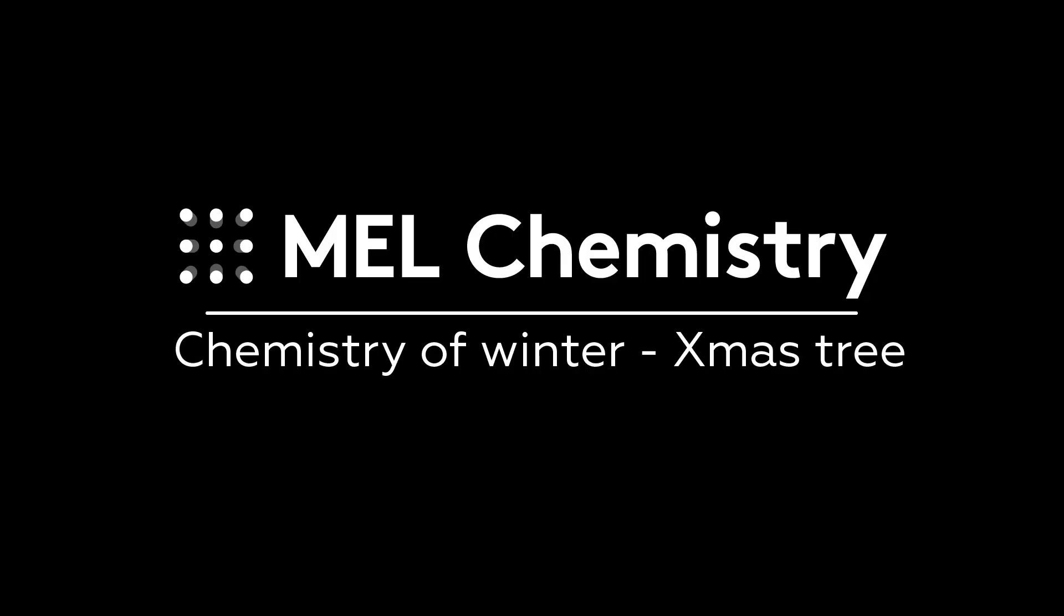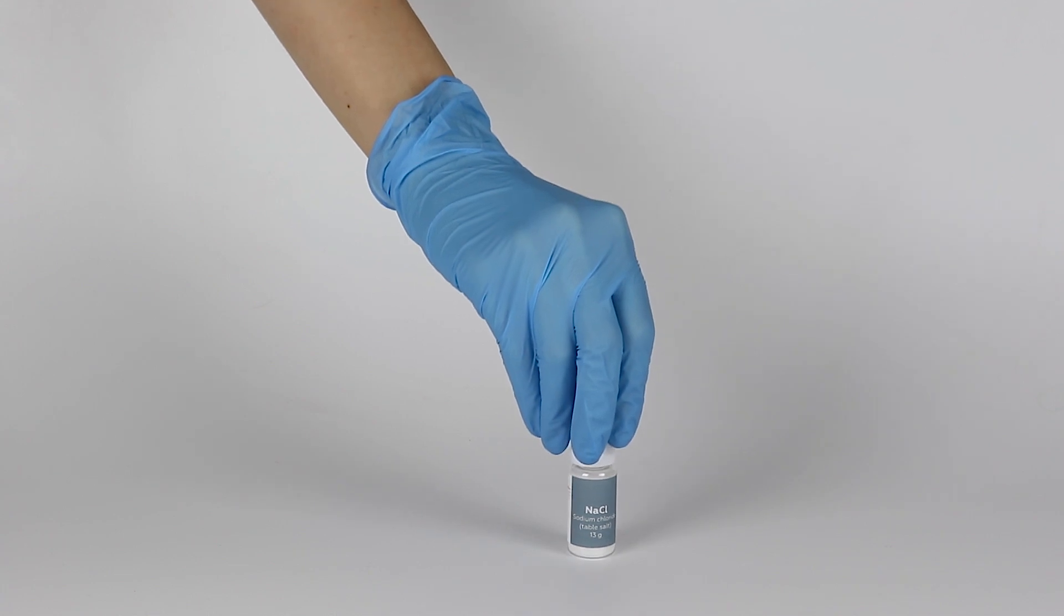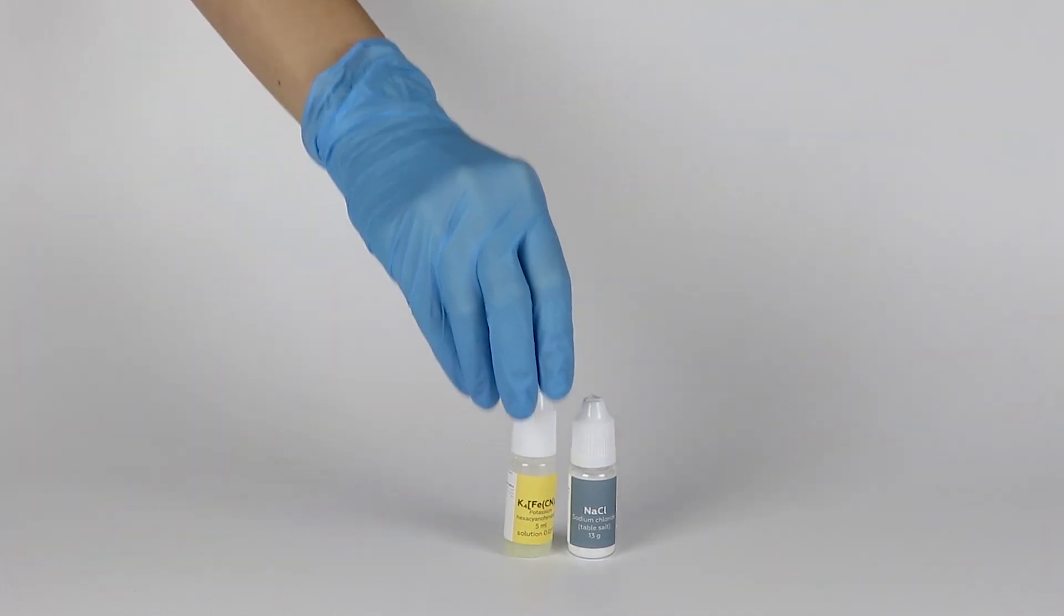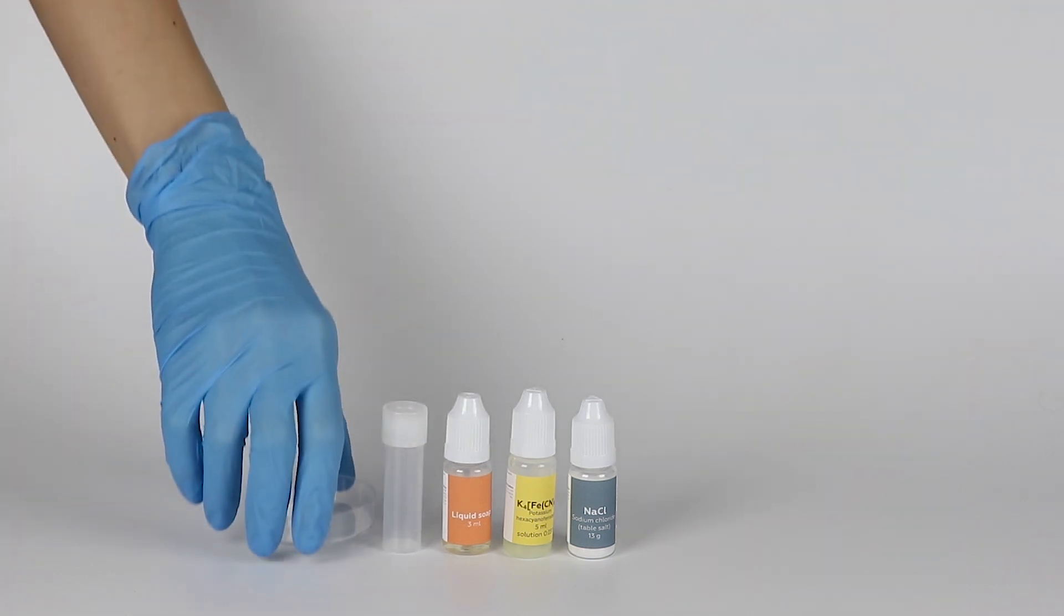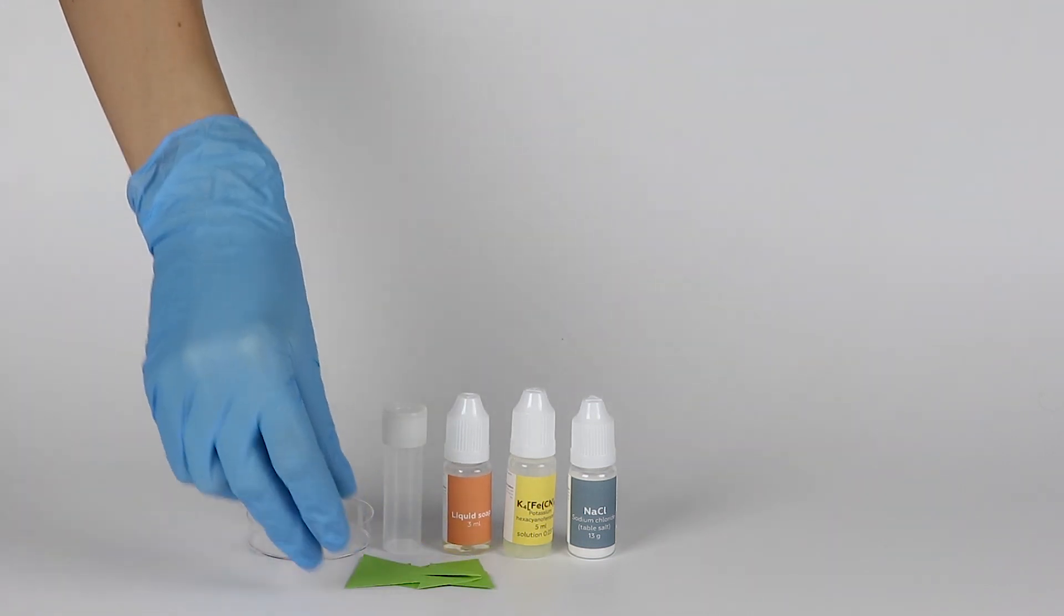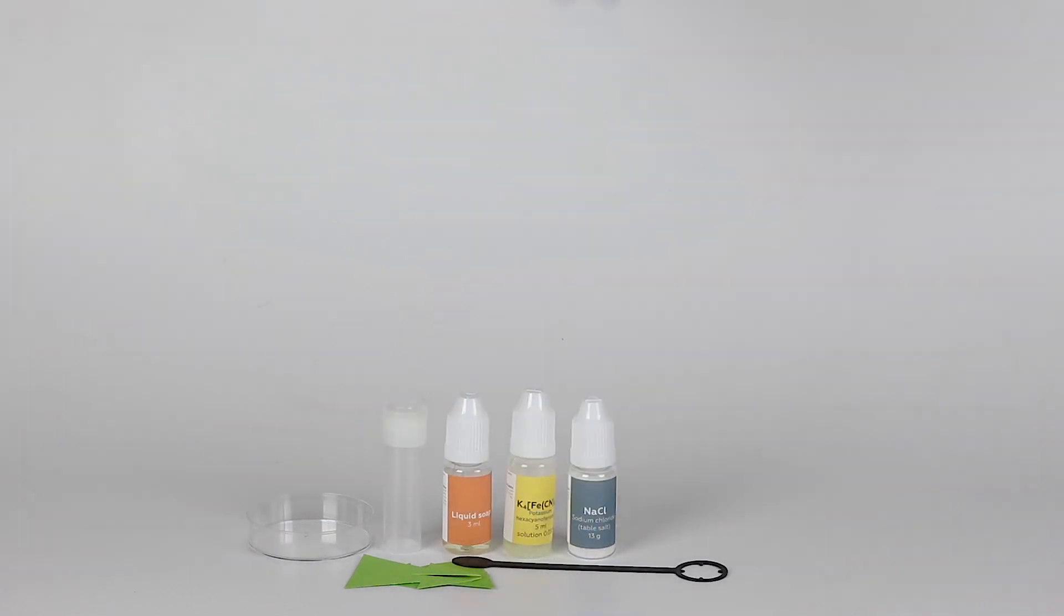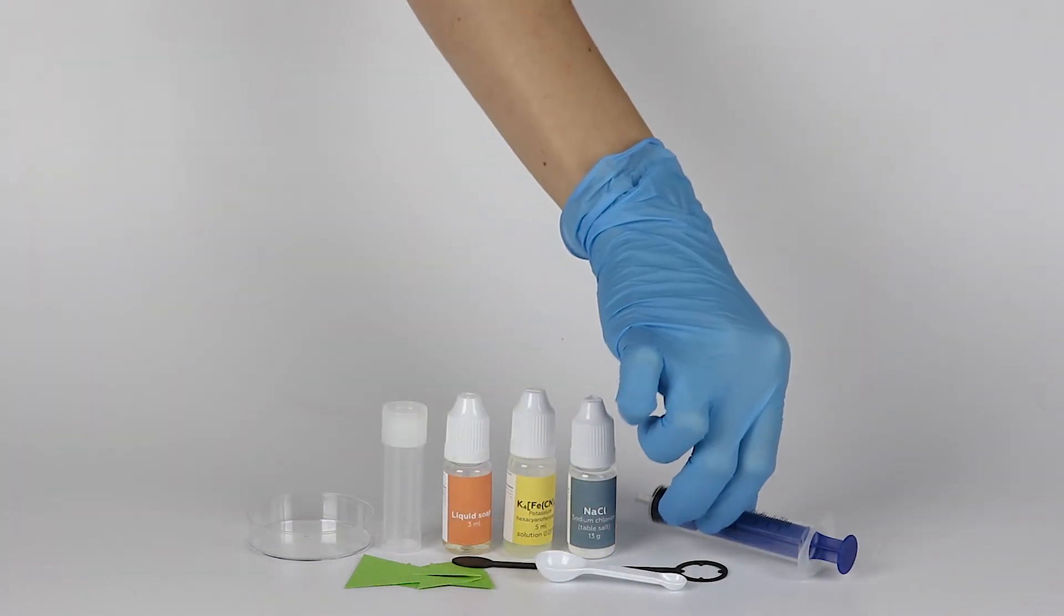For the Christmas tree experiment, you will need sodium chloride, potassium ferrocyanide solution, liquid soap, a plastic vial, a petri dish, a paper template of a Christmas tree, a vial holder, a measuring spoon, and a syringe without a needle.